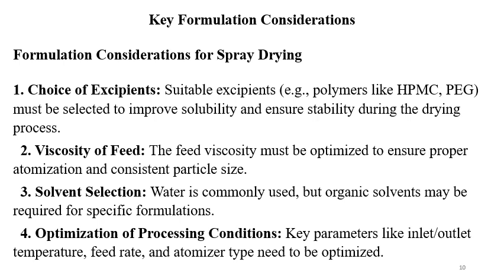Viscosity of feed. The feed viscosity must be optimized to ensure proper atomization and consistent particle size. If you use too viscous feed, you will not have uniform particle size of the dried material. Also, gun choking will be there, or feed system will not work properly. If you use too thin feed, then solvent required will be more.